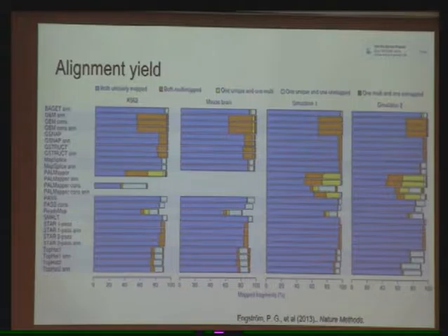Uniquely mapped and multi-mapped are 2 basic concepts in alignment. Uniquely mapped means you have a sequence read, and the aligner was able to place it or find its best hit to 1 unique location in the genome or transcriptome. It had a single best hit. Multi-mapped means that its best hit was equally good to multiple places. So possibly it contains some repetitive sequence, or maybe it's very short, and so it matches several locations in the genome or transcriptome equally.